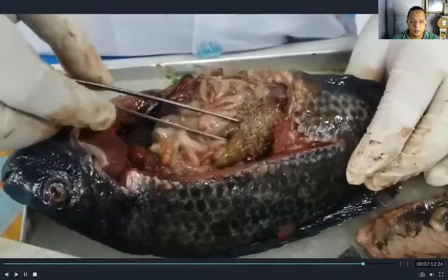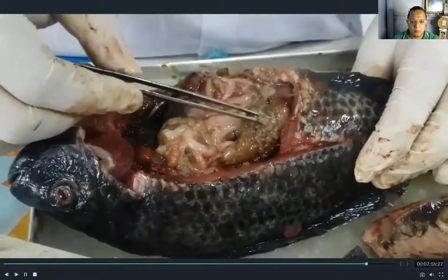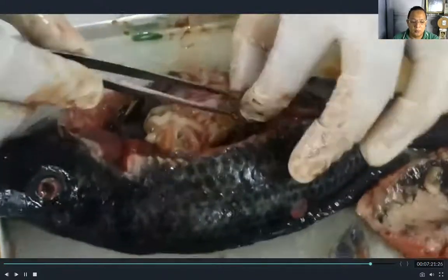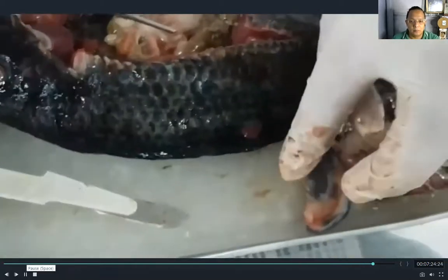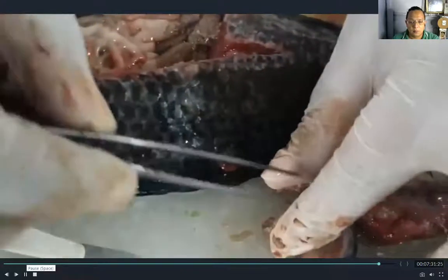As you can see, our fish is female because it has ovaries. This is the ovaries — it contains eggs. These are the eggs of the fish. Normally, the reproductive organ of the fish is called the gonad. The gonad of the male fish contains milt that fertilizes the egg of the female fish.